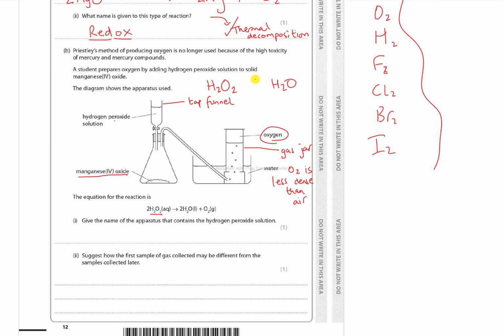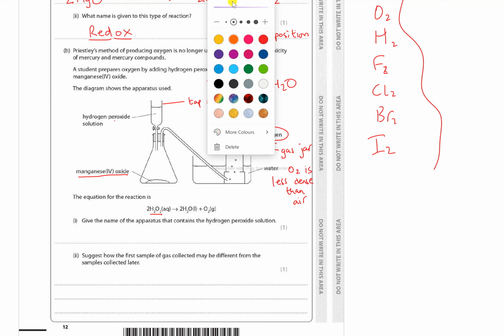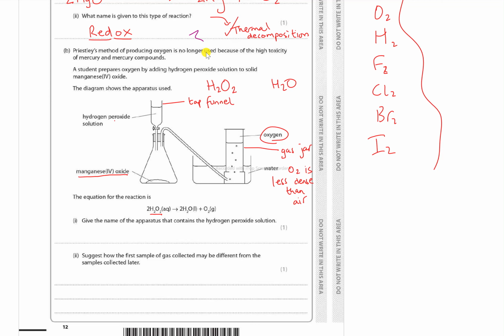But it's also known as a dropping funnel or a separating funnel. Right, so I call it a tap funnel.